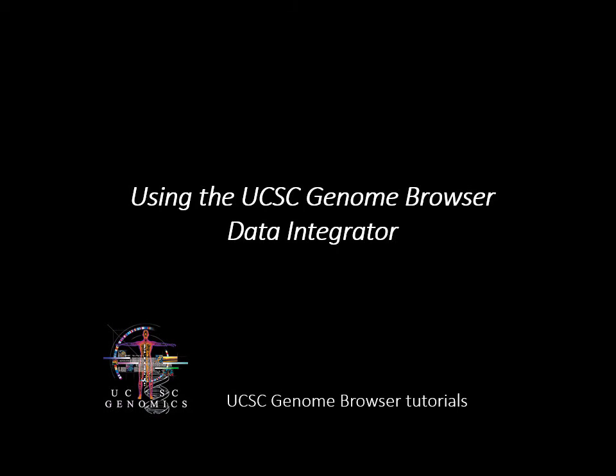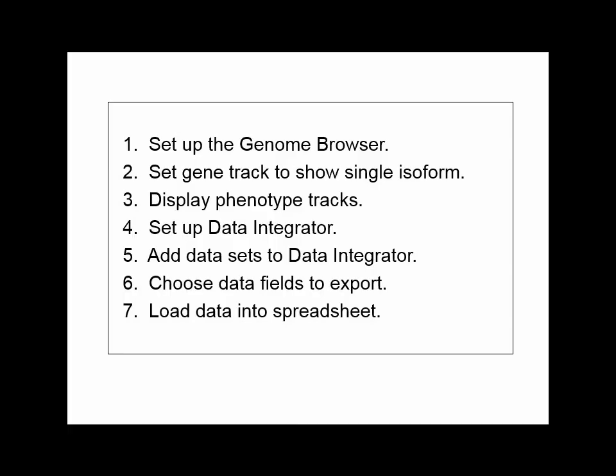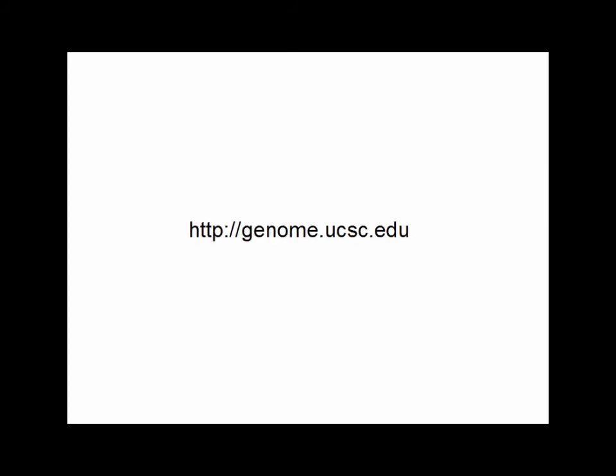In this demonstration, we will show how to get variant data from the UCSC Genome Browser tables using the Data Integrator.